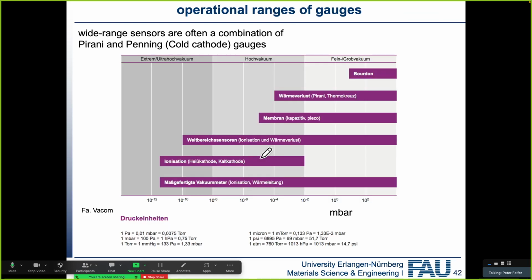And this is just an overview of where we can use them. So our ionization gauges typically go down to 10 to the minus 11. On the Oxcart, for example, the vacuum is better than what we can measure with regularly available measurement gauges. But there you can get some custom-made ones, very special hot ionization gauges and so on. But for us, if we know from the experiment we see no residual contaminant in the experiment, then I don't know if we really care if we can precisely measure what the pressure is.